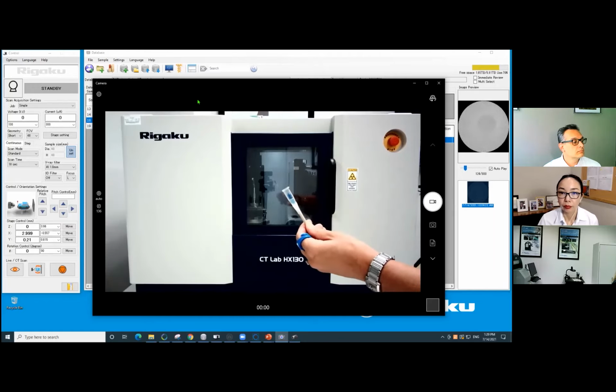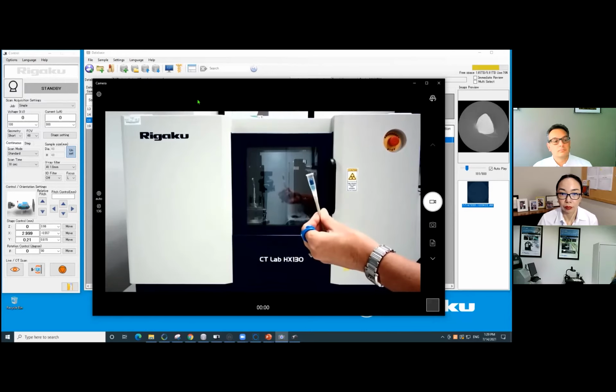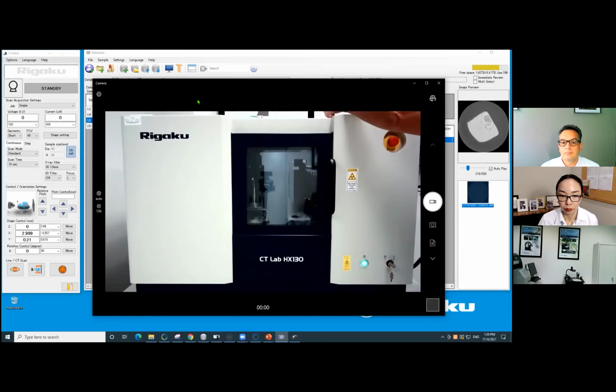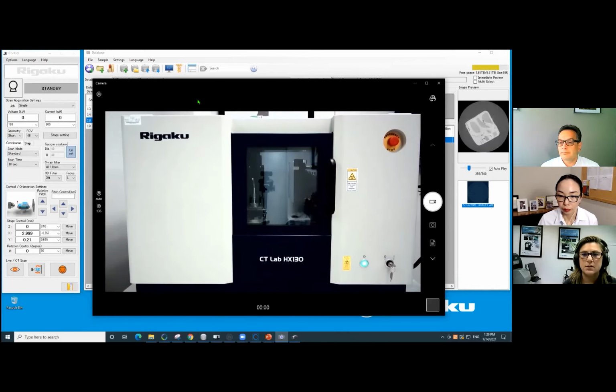Well, this particular pain reliever is marketed as fast relief. So we would expect something to happen pretty quickly whenever we put it in and start our experiment. So how are we actually going to do that? Well, what I'm going to do is add some water to it to simulate whenever you take the pill and it will start to dissolve.